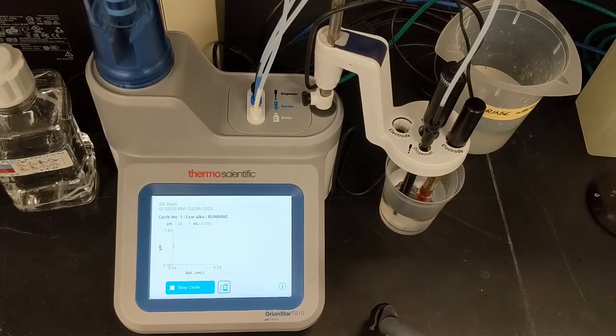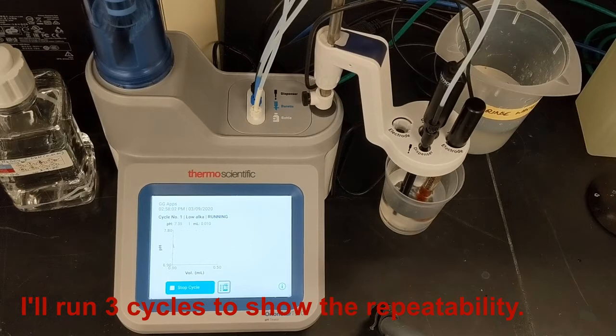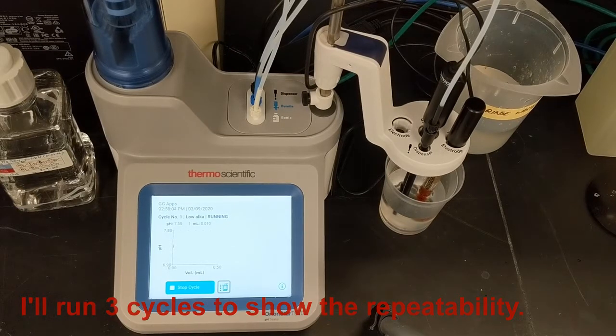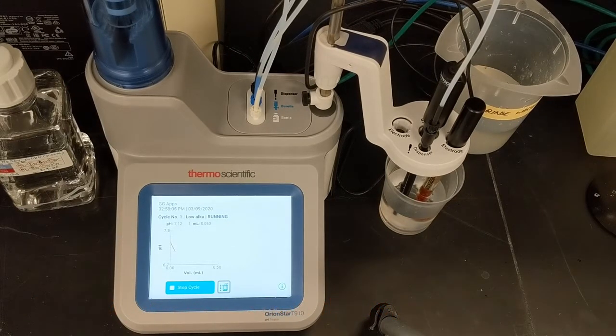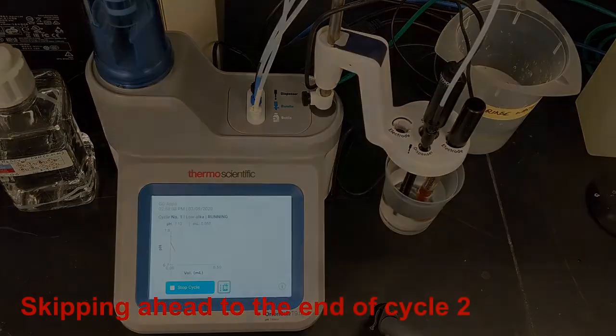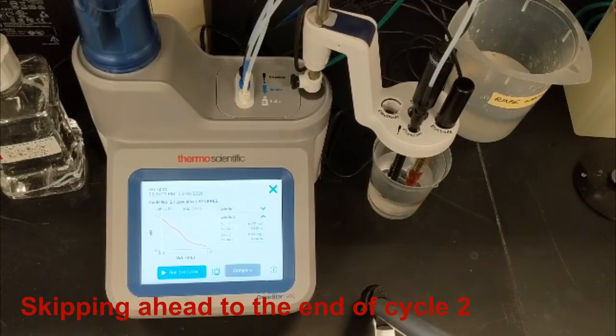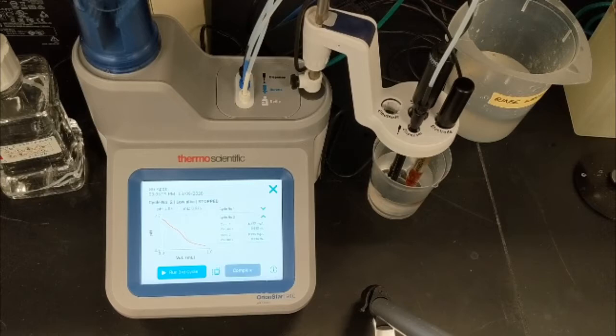I've decided to run three cycles of my sample to demonstrate the repeatability of this titration. I'm skipping ahead here to show the results displayed on screen after the second cycle. Note that the titrator is programmed to find endpoint 1 at pH 4.5 and endpoint 2 at pH 4.2.